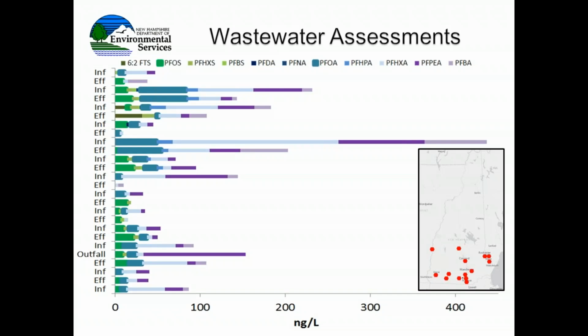We've also sampled about a dozen wastewater plants just to get some background information, and you'll see you detect PFAS in all wastewater, including the phased out or banned PFOA and PFOS compounds, as well as the newer compounds that are in use.